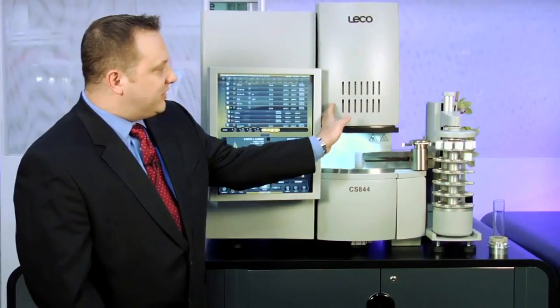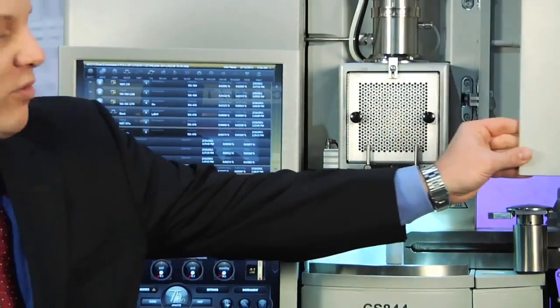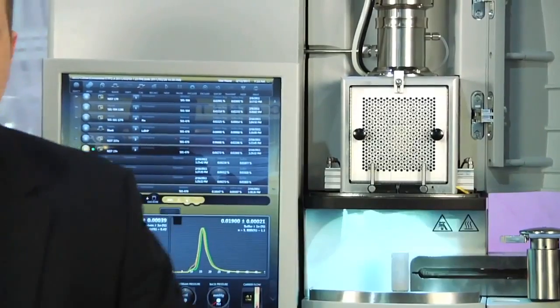Some of the other features of the system revolve around our high efficiency furnace, the first of which is an automatic tube exchange system.